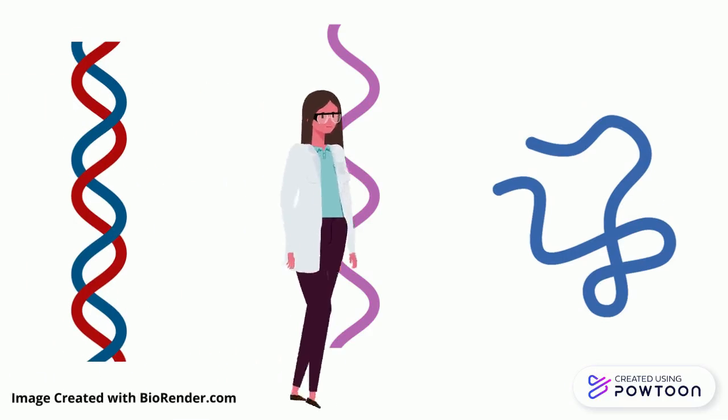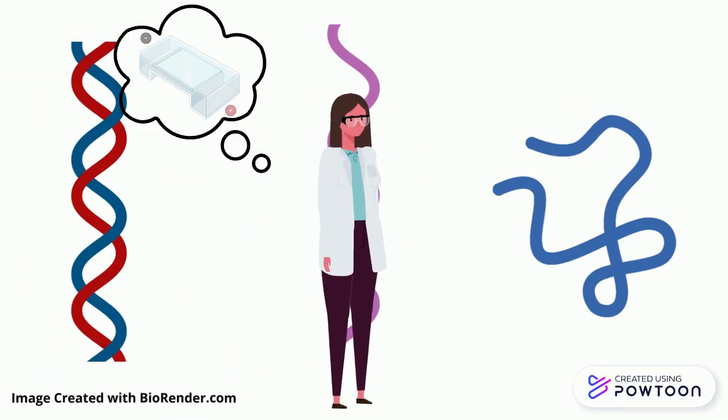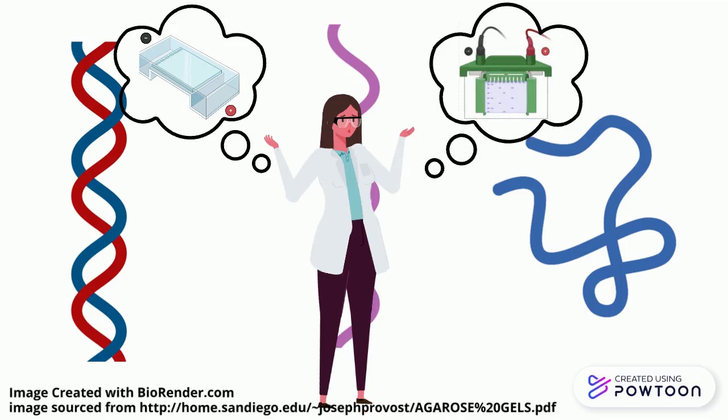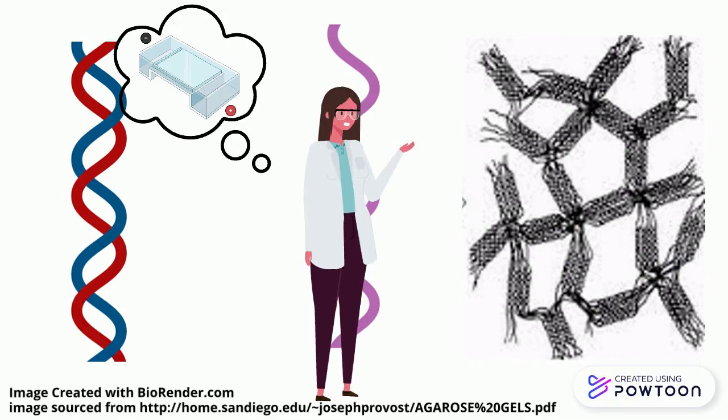Based on the experiment we have run and the subsequent products that we want to investigate, we now need to decide whether we want to run an agarose or a polyacrylamide gel. Either gel can run the substrate in native or denatured states, depending on what we're looking for. The agarose gel matrix is composed of long, unbranched chains of uncharged carbohydrates, resulting in a gel with large pores, allowing for the separation of larger macromolecules.